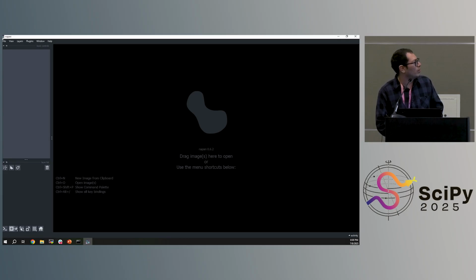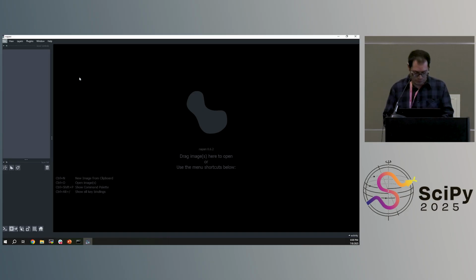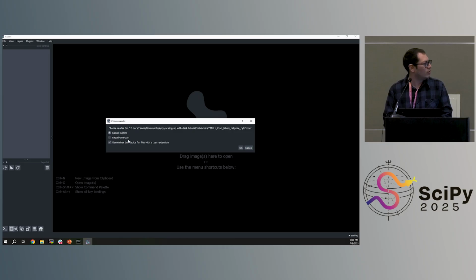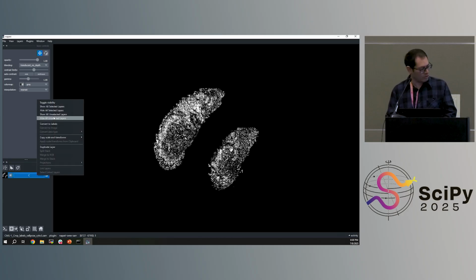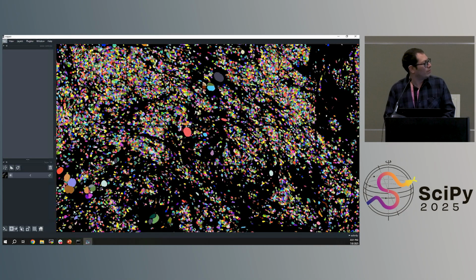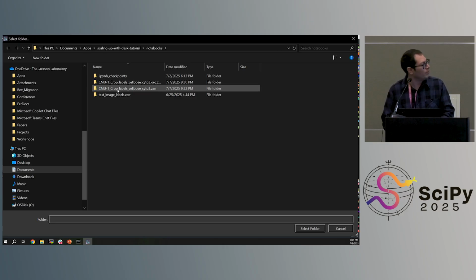So I'm going to bring this stuff here. Basically, I'm going to grab this into a function, let's call it inference. We know that this is applied per chunk, so it receives an image chunk. We can tell it whether or not we want to use the GPU, so by default I'm going to set it to false. The model type, we are going to set by default to the Cellpose model. I think this is enough for that.